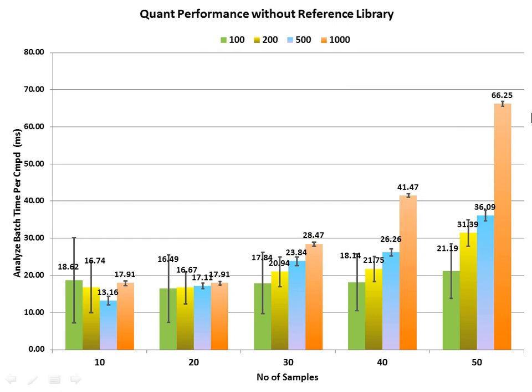So you start to see at the 1000 compounds a non-linear behavior where it takes longer as that batch has grown. So for your particular use, you take the number of samples in your batch times the number of compounds in your method and then multiply by the compound sample time and you'll get a ballpark estimate. Mileage may vary.